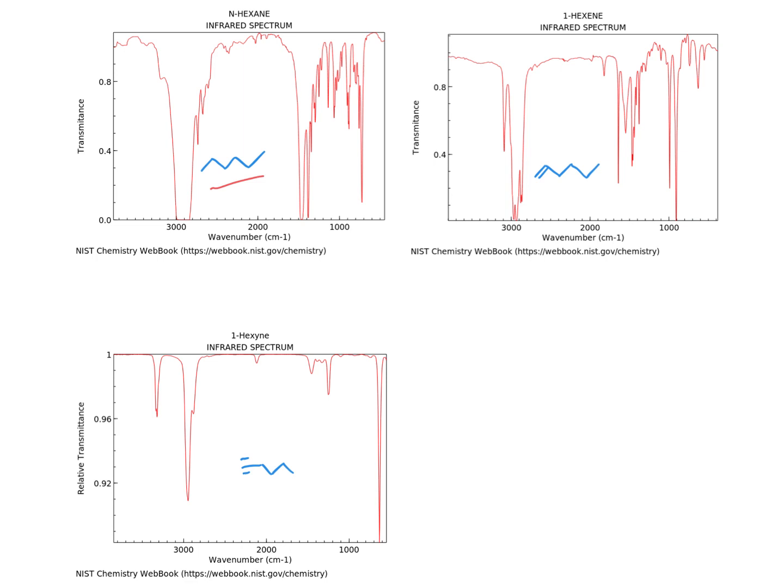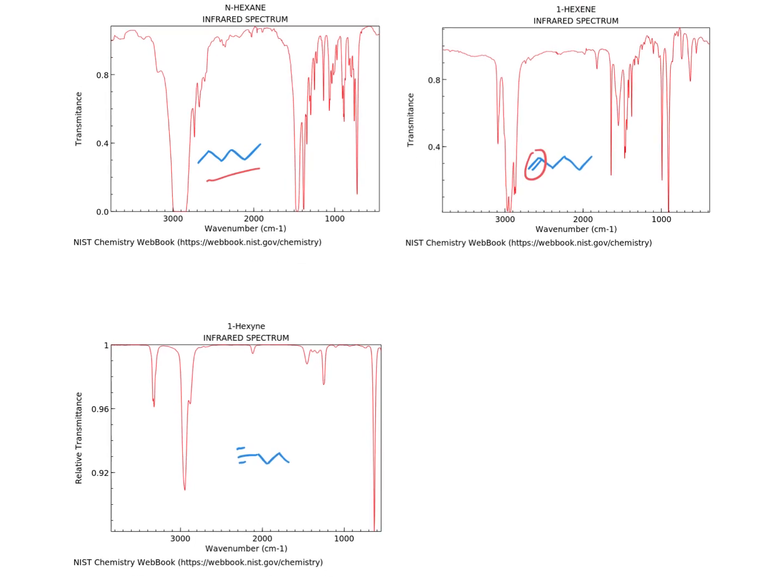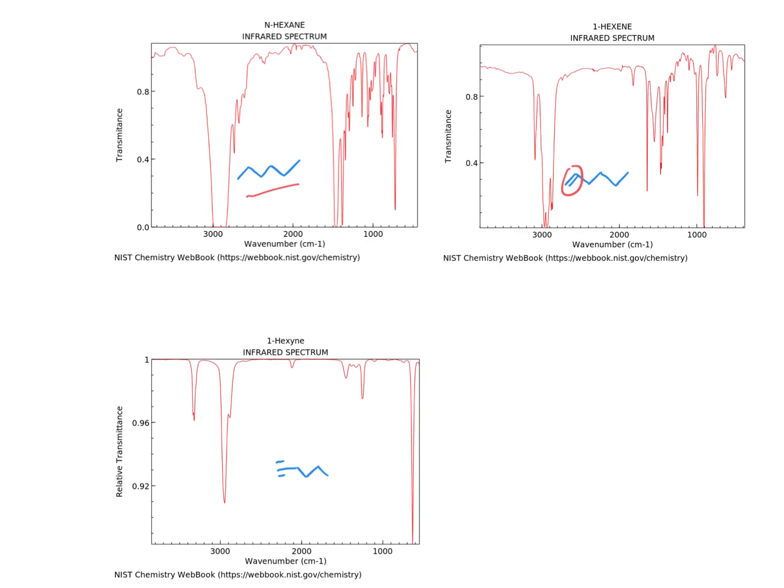Look what happens as we introduce, though, a C=C double bond. We see here that this is the CH that is coming away from the rest of those CHs. That is the CH from the sp2 carbons right there, okay? So it's not just one CH, it's the CH2, and it's the hydrogen right up here. And you're not going to necessarily see a difference. Sometimes you do. It depends on the compound. It depends on the IR. But we see some splitting that's happening there.